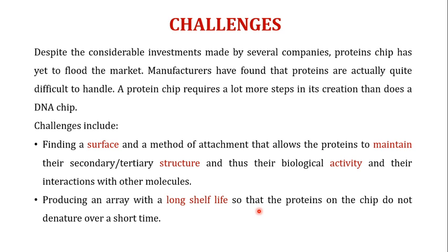Now there are a lot of challenges as far as the protein microarray is concerned, and despite the considerable investment made by several companies, the protein chip has yet to flood the market. The manufacturers have found that protein microarrays are actually quite difficult to handle in comparison to the DNA microarray, and a protein chip requires a lot more steps in its creation than does a DNA chip.